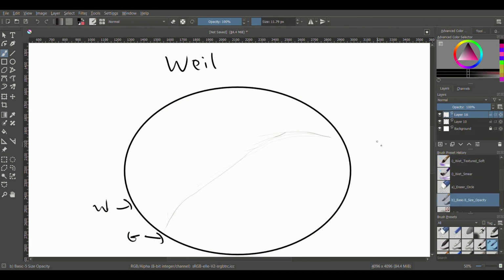Next up is our Weil stain, and our Weil stain is going to allow us to show myelin sheaths. This one's going to be cut at 10 to 15 microns. And essentially, it's going to let us see the difference between white matter and gray matter on kind of a gross scale.